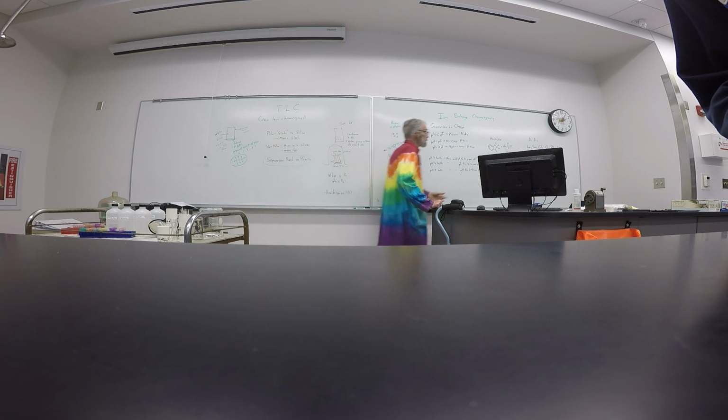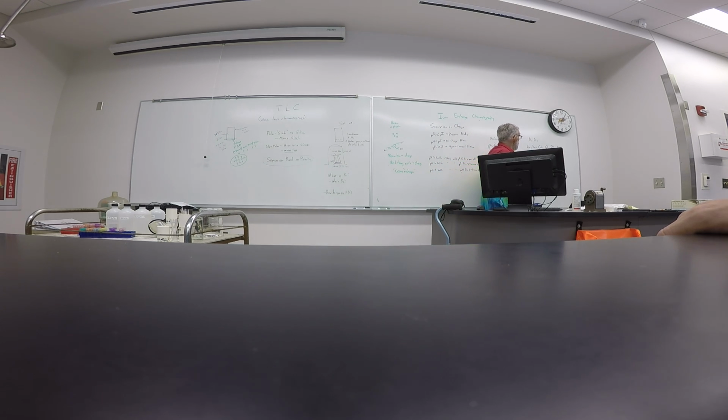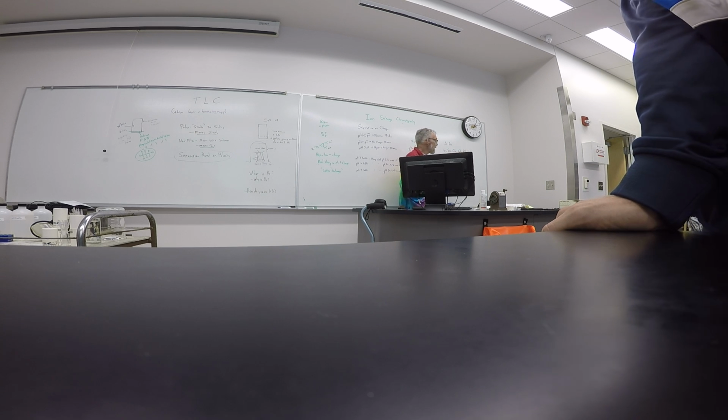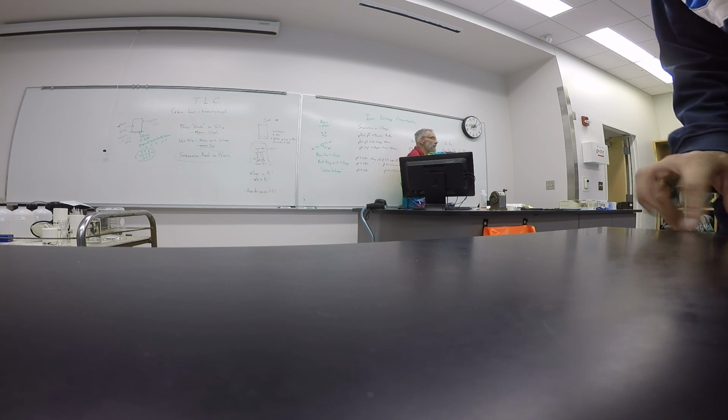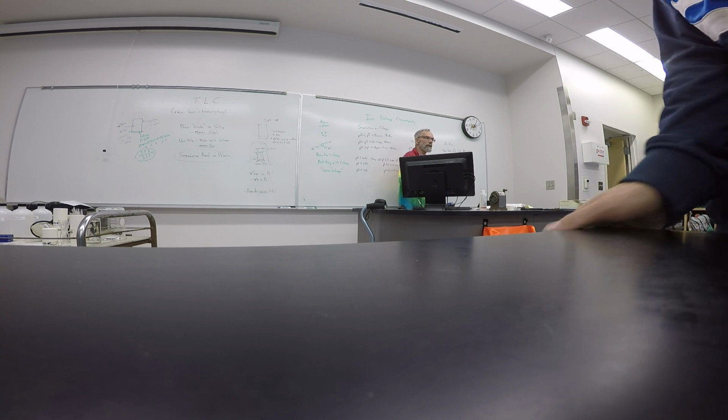Now if you look at this, we've got a couple of nonpolars, phenylalanine, leucine. We've got a couple of kind of intermediate polarities, serine and glycine, and then the glu and the lys are charged, they're different. So you're going to see a mix, and many times you'll have a couple of these coming out at the same time because they have very similar polarities.